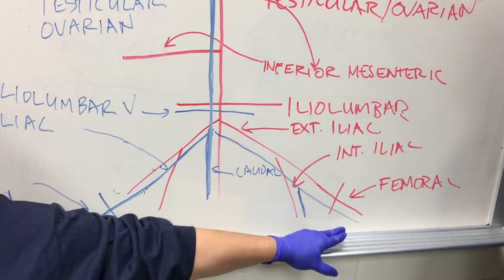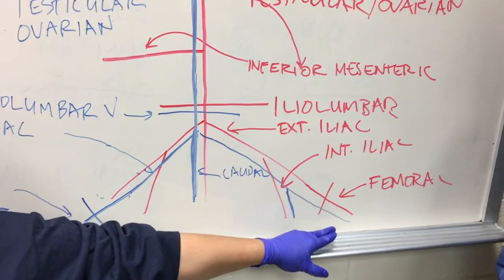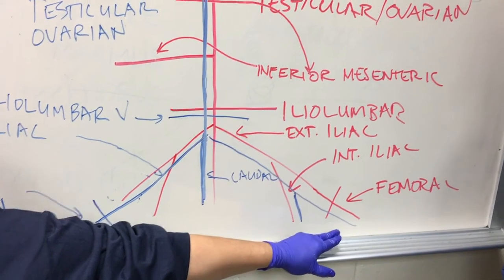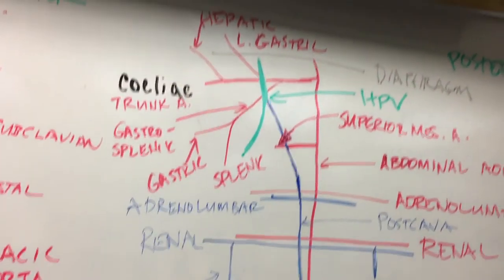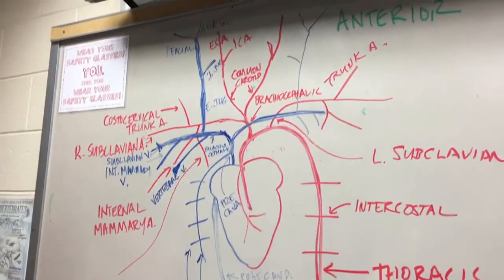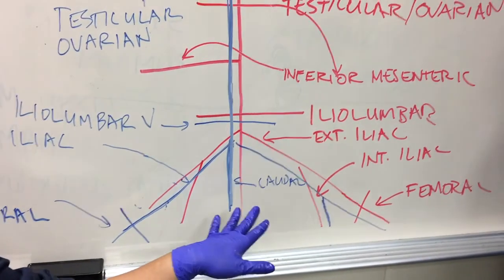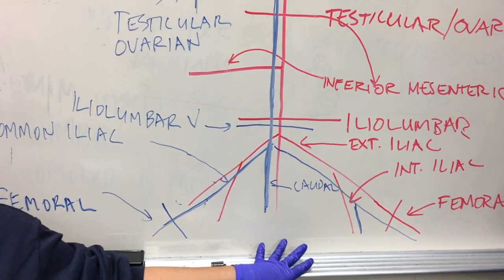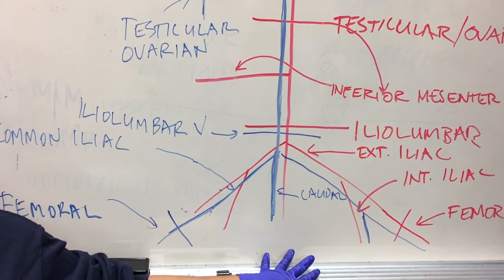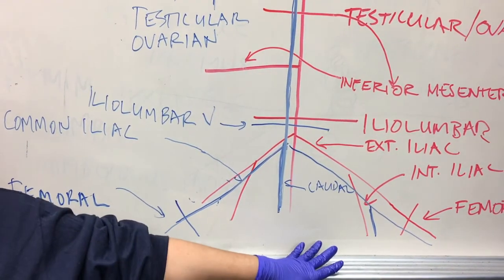So when we talk about vein flow, we're talking about bringing deoxygenated blood back to the heart. So if we work from the tail back to the right atrium and then the head region back to the right atrium, we'll get our venous flow into the right atrium of the heart. So what's cool about the veins is that they often mirror the pathways of the arteries. So we're looking for blue versus pink usually. Veins are in blue.